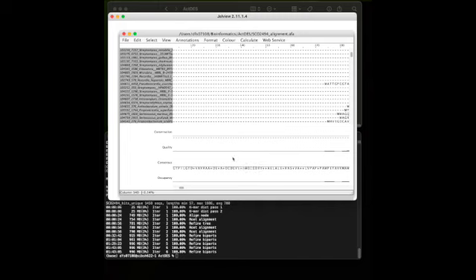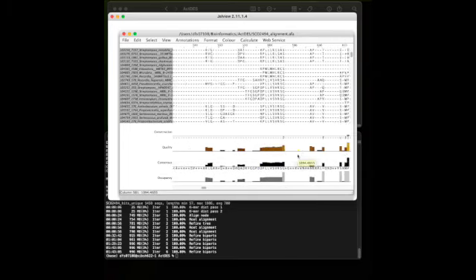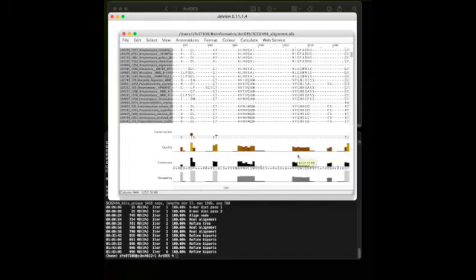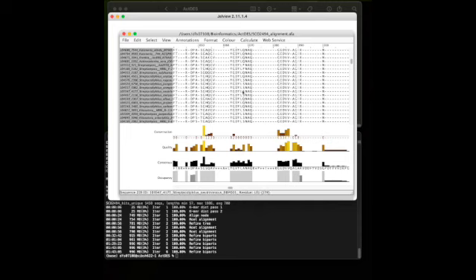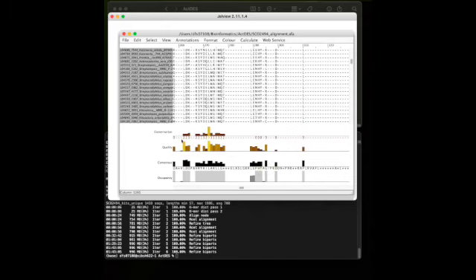And you can already start to look along the alignment and look at the quality of that alignment. So by removing those unusual sequences that we talked about earlier that are very short, you can go through the file and remove those, and the alignment looks pretty good in certain sections, and this requires a lot of manual time actually looking through and manually curating not only the sequences in your file, but also checking that the alignment has gone to plan.